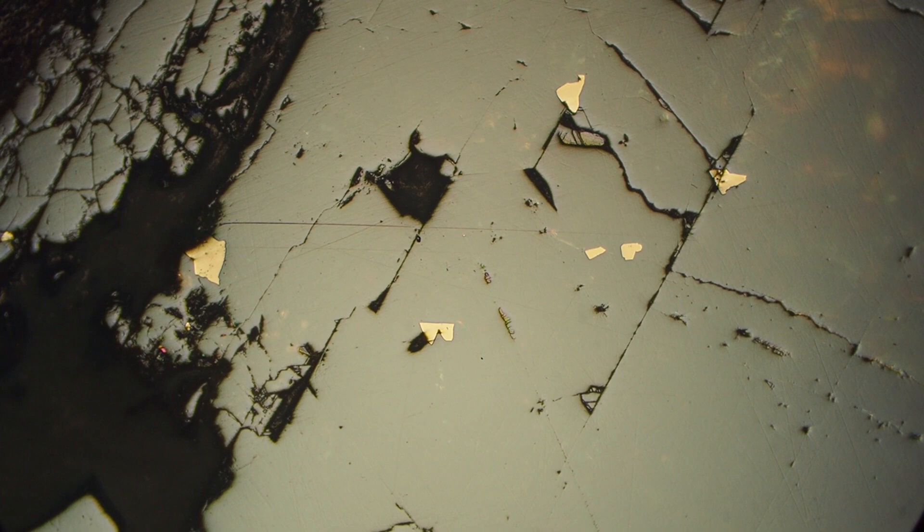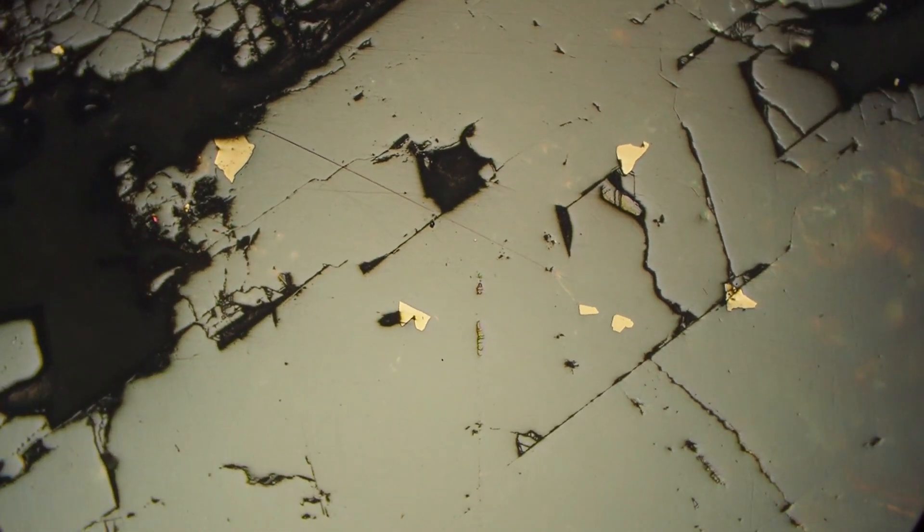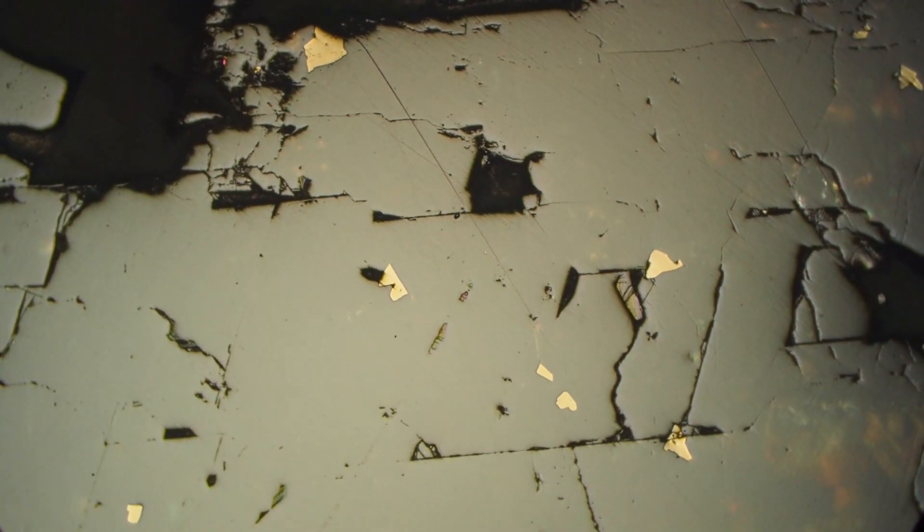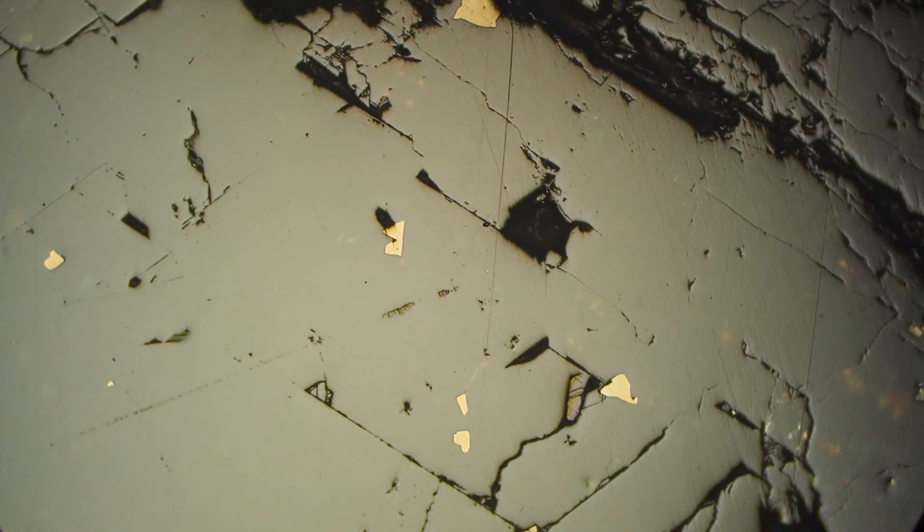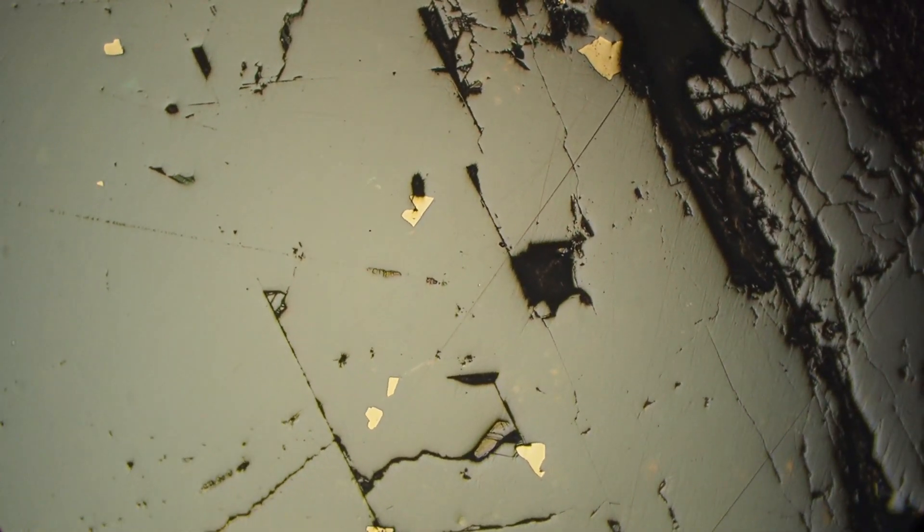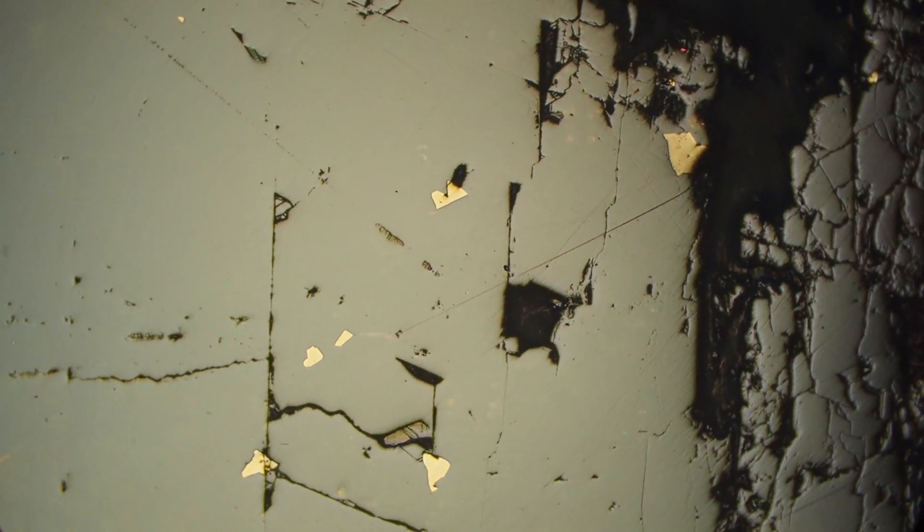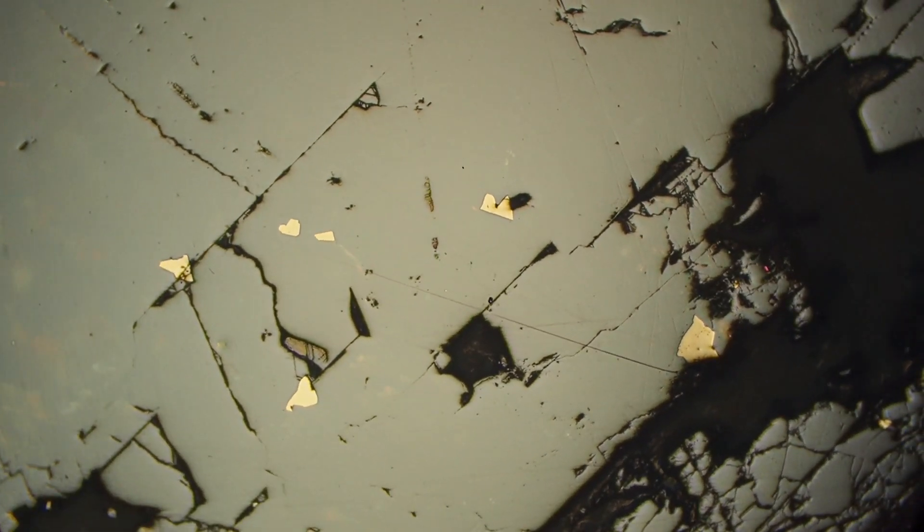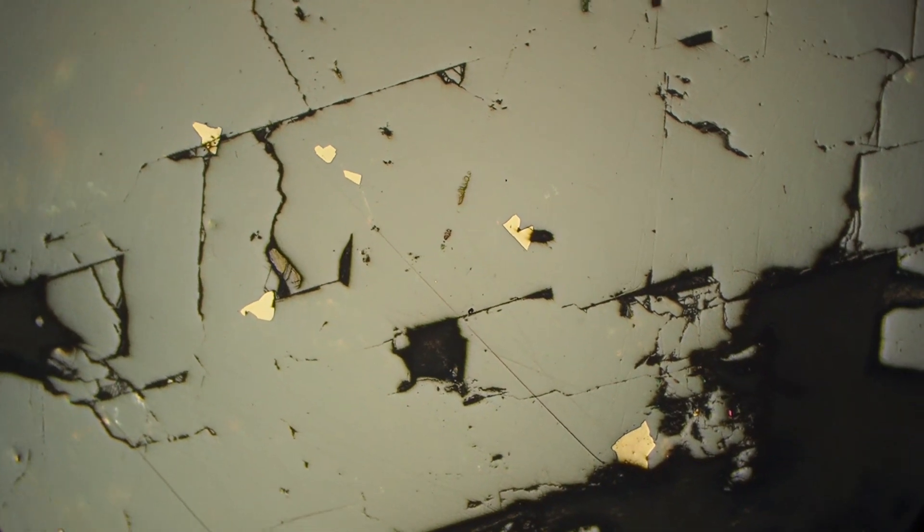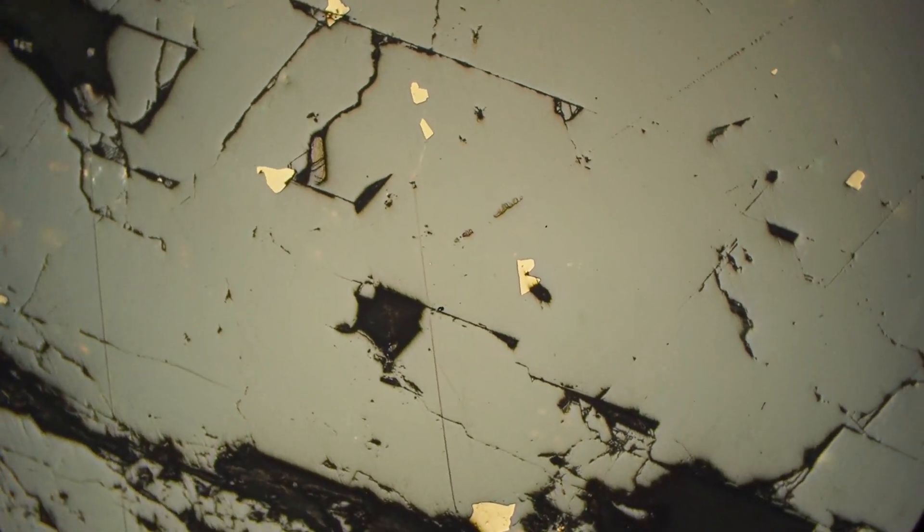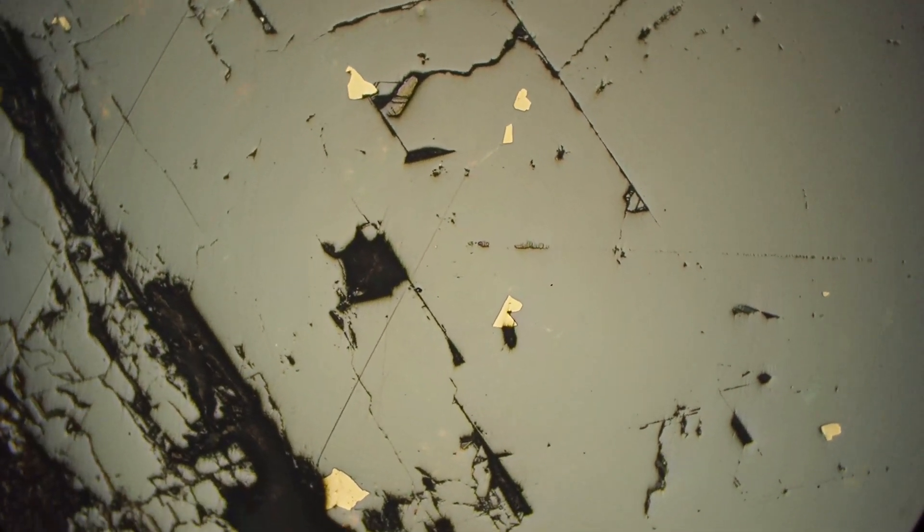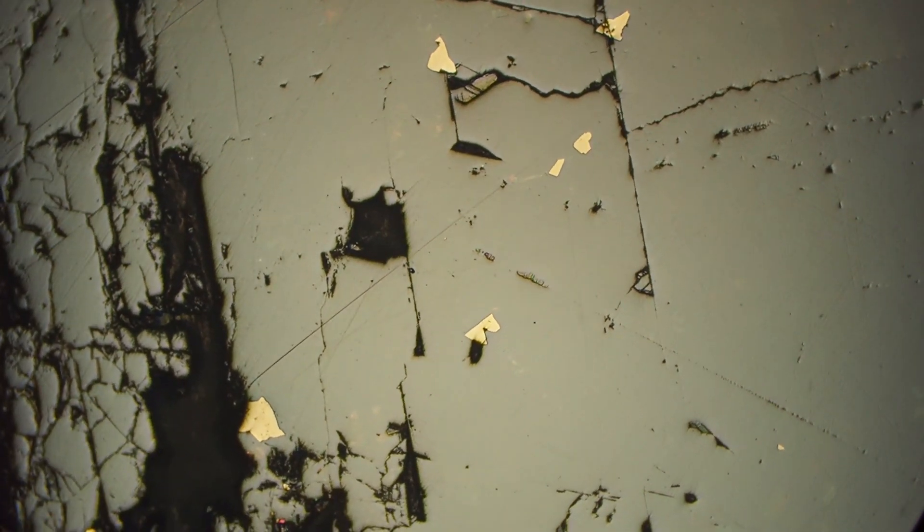So here again we have another piece of sphalerite, again this medium gray color, and it's not showing any changes as we rotate in plain polarized light so it's not bireflectant. And again it's medium hardness, usually takes a pretty good polish, so we're not seeing a lot of difference between the sphalerite and the pyrite in terms of polishing.